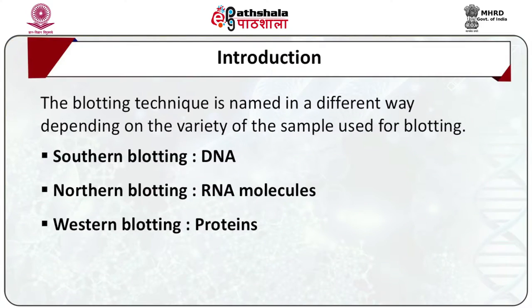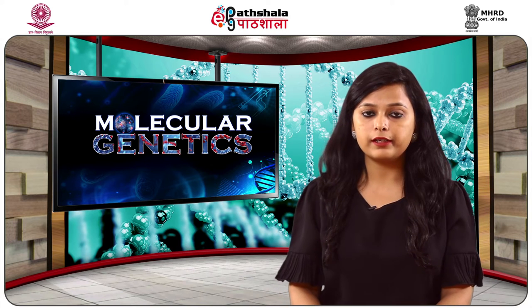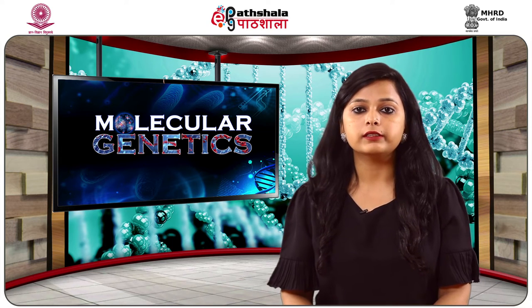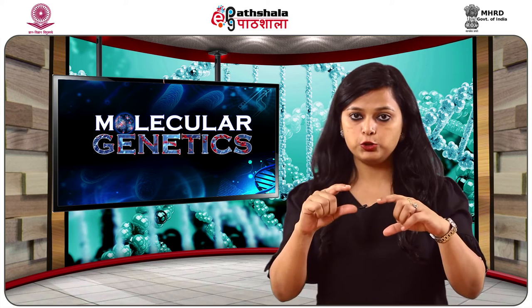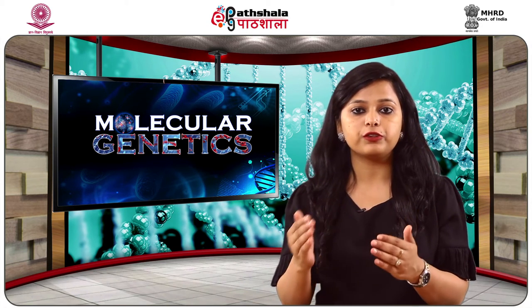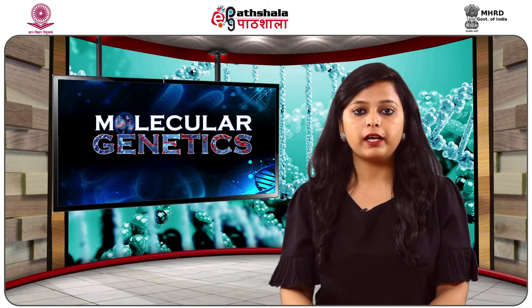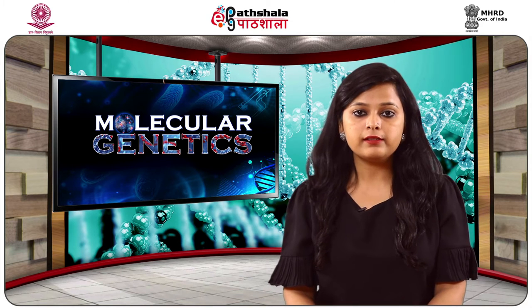What is southern blotting? The presence or absence of a particular nucleotide sequence in different DNA samples is verified using the technique of southern blotting. Now the question is how to perform southern blotting. Firstly, DNA is isolated and digested using a restriction endonuclease. These digested DNA fragments are separated on the basis of size by gel electrophoresis, which is agarose gel electrophoresis. The separated fragments are then visualized on a UV illuminator after staining the agarose gel with EtBr, that is ethidium bromide.